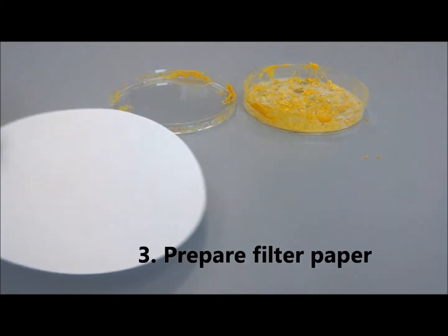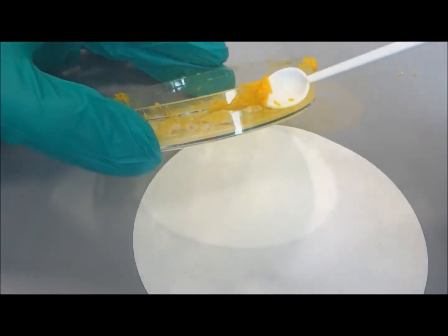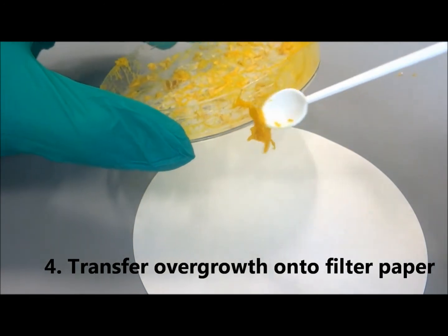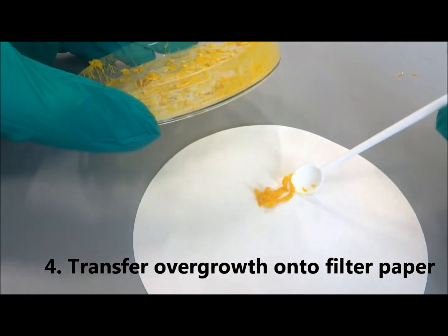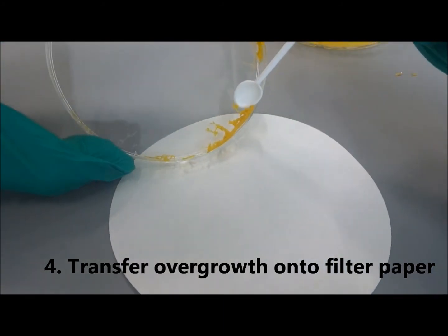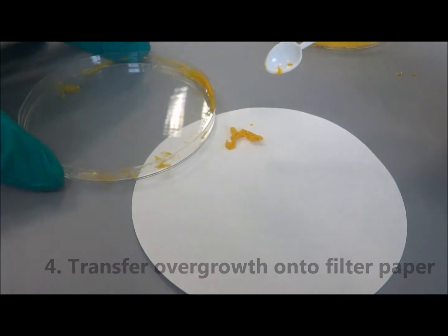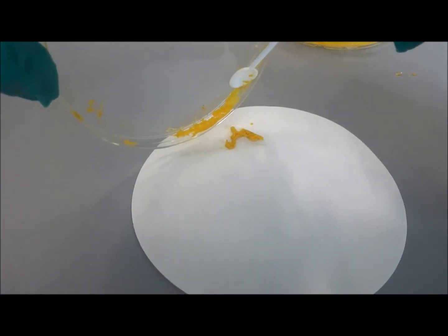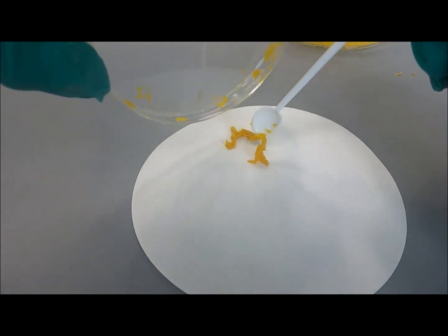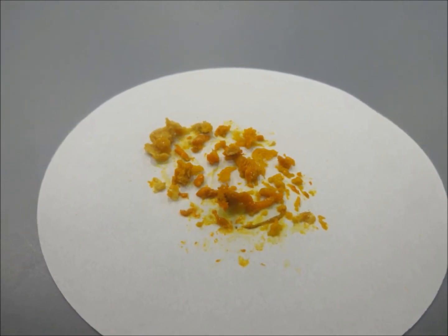Next, prepare a clean piece of filter paper. Use a clean spatula to collect the slime mold overgrowth on a piece of filter paper. The slime mold is soft and slimy. It can stick to the plate and can sometimes be difficult to remove. You may collect multiple fragments of slime mold from different plates.